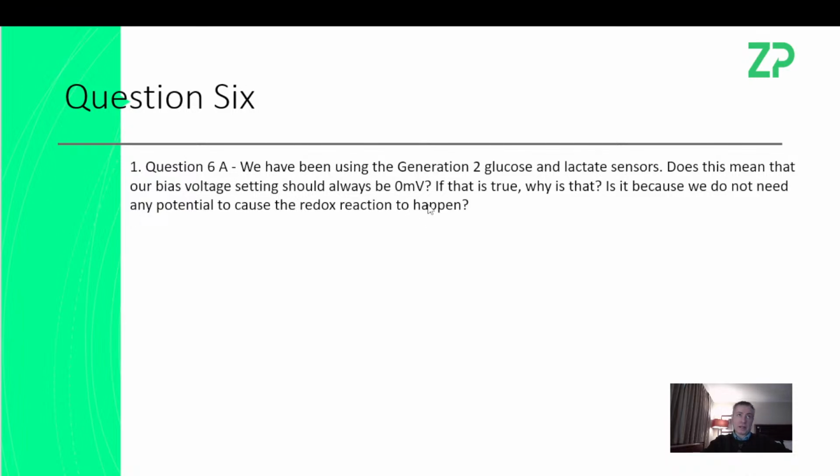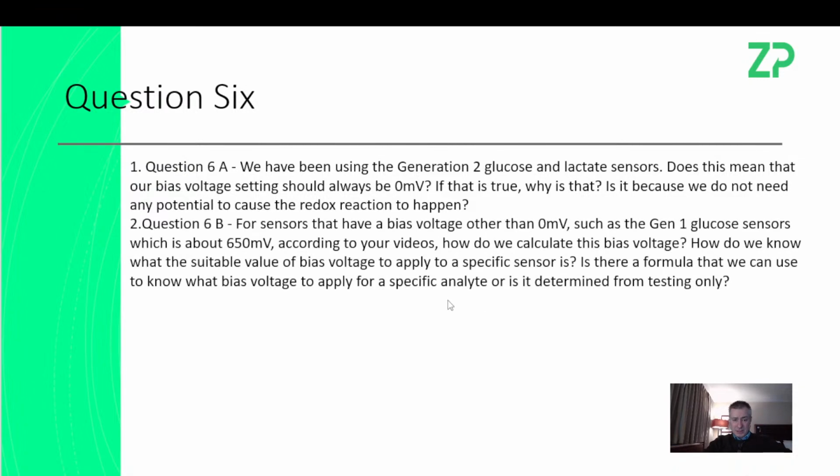That reference that you're applying the voltage versus is just a local reference. It's not the global voltage reference. So you are applying a potential. It's just versus the reference it says 0, but versus absolute 0 voltage, it's not 0.